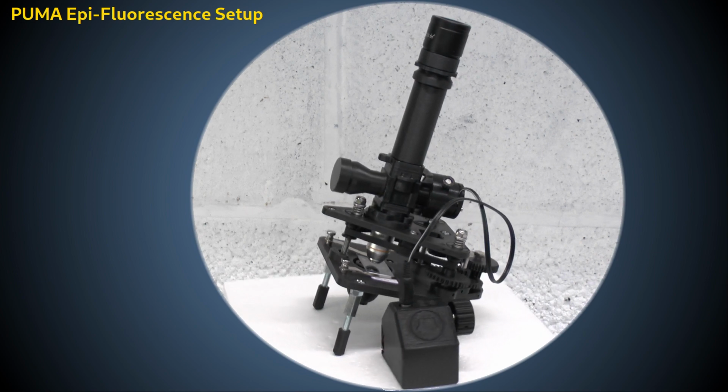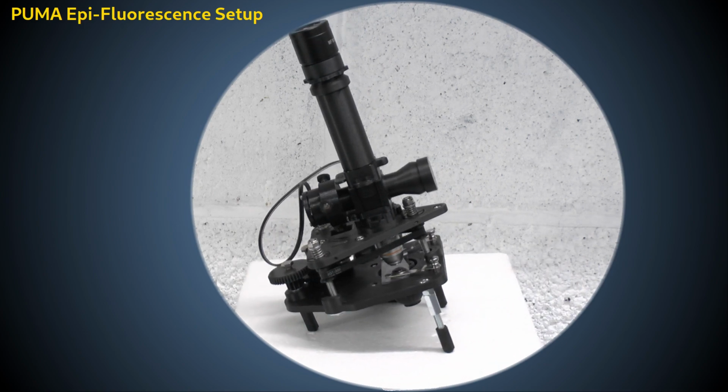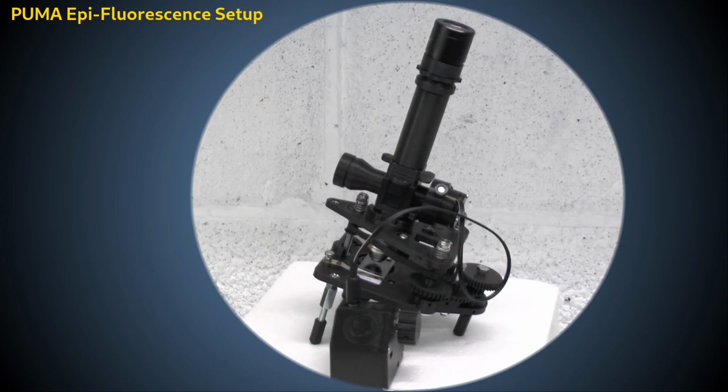Before showing you how to build the Epi-illumination modules, I'll demonstrate two practical Epi-illumination configurations of PUMA and show you some sample images. First, we'll look at PUMA as a biological Epi-fluorescence microscope for fluorescence.